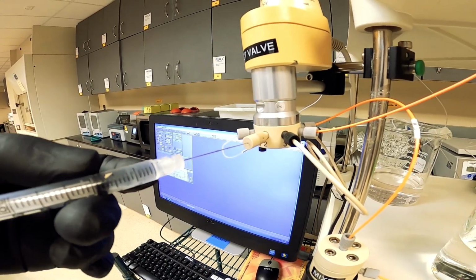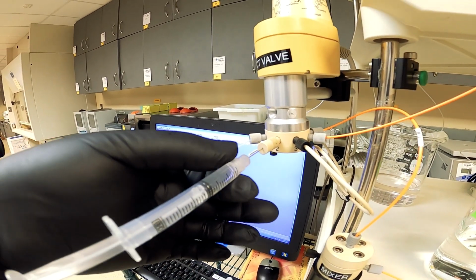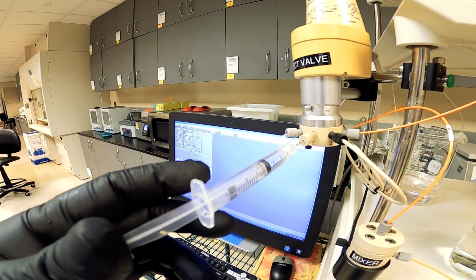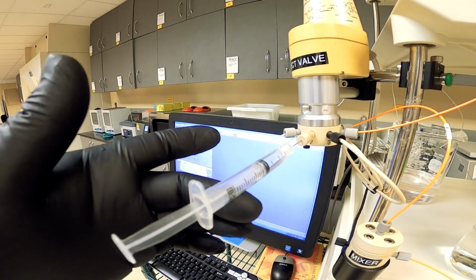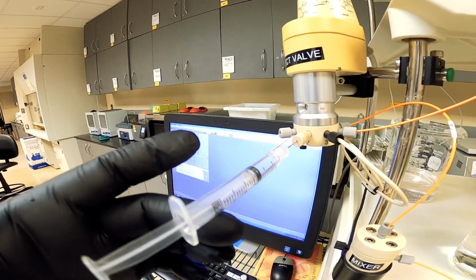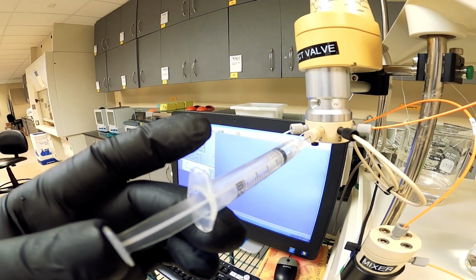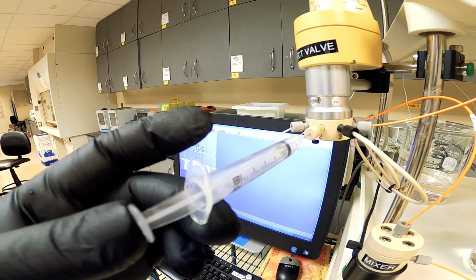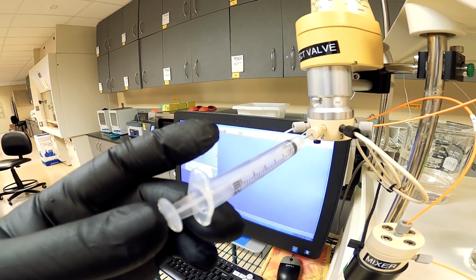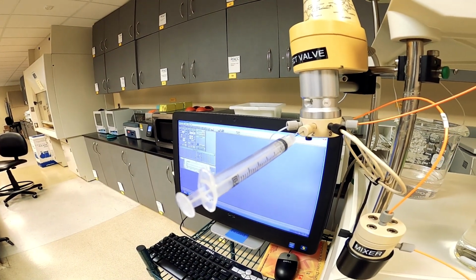Gently place our needle into the injection port, and once it stops, don't force it any further. Then take the plunger, and you can support the barrel if you want, so it doesn't bend the needle. Try not to bend the needle, and then we're going to slowly push in our sample. You'll feel a little bit of resistance, but keep pushing, and once it stops, we'll leave the syringe there and return to the software.